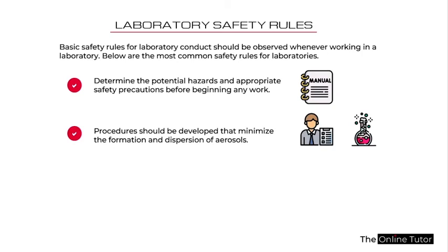Now, procedures should be developed that minimize the formation and dispersion of aerosols or gases. So this is normally going to be done by your instructor or your lab analyst who is in charge of your experiment. So he's going to make sure that the procedures they come up with are those that minimize the formation and dispersion of aerosols for you. But in case you are supposed to come up with your own experimental process, make sure you do a thorough research.